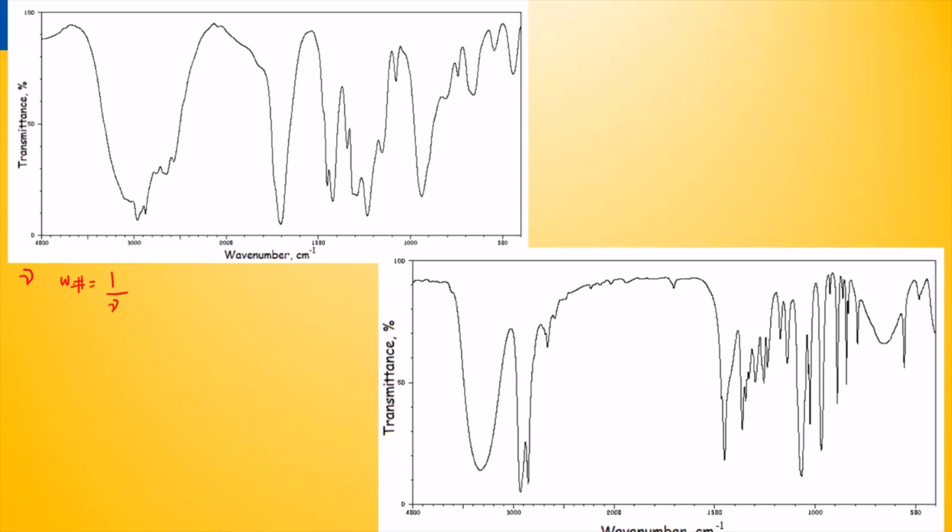Strong typically means it literally fills that particular peak, very, very long, from all the way from 100 to almost 0, or at least it fills up more than 80% of the graph. Medium is about 50% of the length of the peak. And weak would be probably 10–20%, almost at the very top.